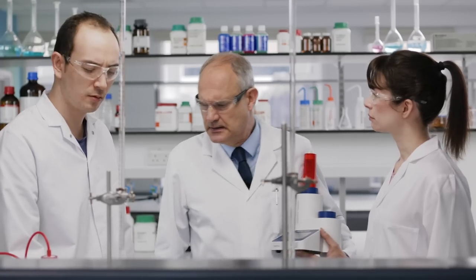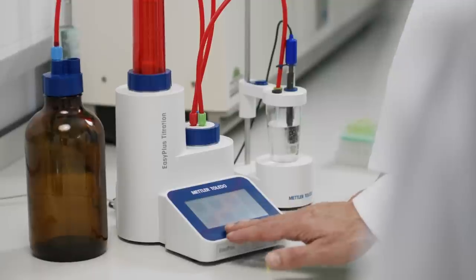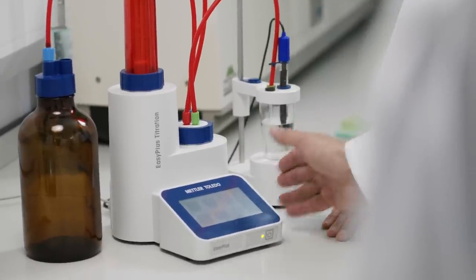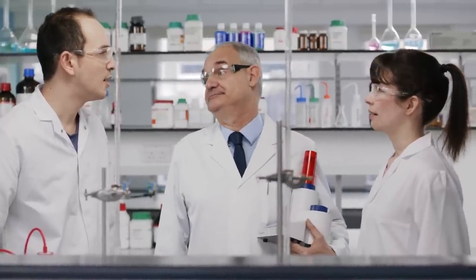Oh. You already have an Easy Plus titrator. And how come you're still arguing about endpoint indication? Charles, please help me on this. She does have blue eyes, doesn't she? No. They're green.